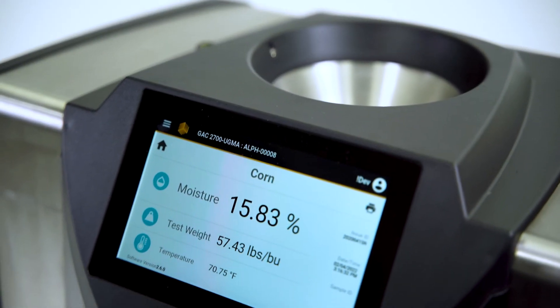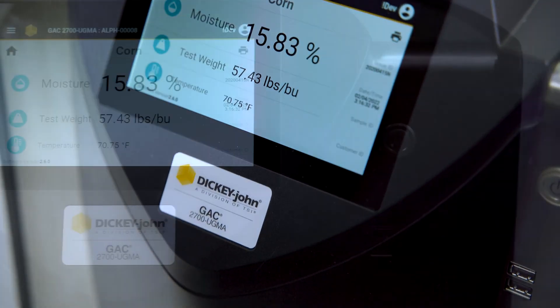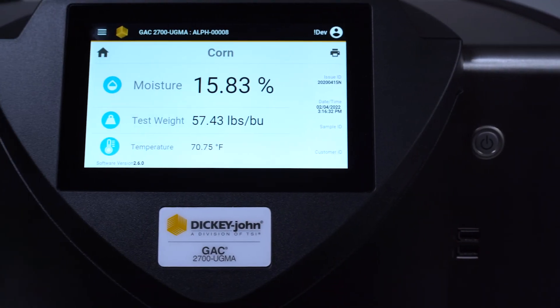This new grain moisture analyzer has been developed with enhanced features designed to make your business more efficient. Let's take a look at what makes it a must-have for your operation.